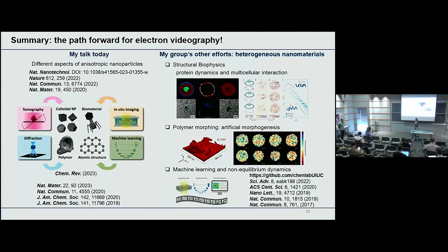Yeah, that's definitely practical. That's a great point. I should mention that in all those movies, the spatial resolution is nanometers. In that particular example, although it's triangular prisms, they kind of stack up, so in the end you get a circular shape. But if you're dealing with a cube, for example, you can see the contour very well. We can actually check the orientation, so we can tell whether it's orientationally ordered or not, without any problem. That would be cool because it's an additional order parameter. Yeah, exactly. A non-trivial interplay between them. Yeah, exactly.